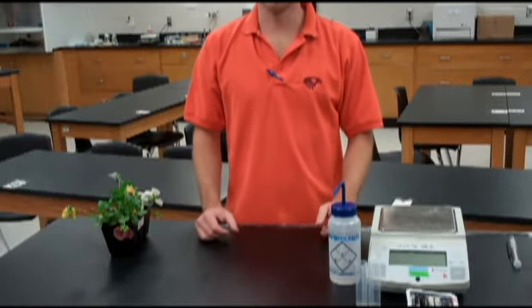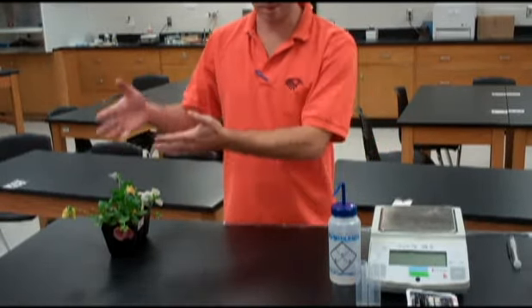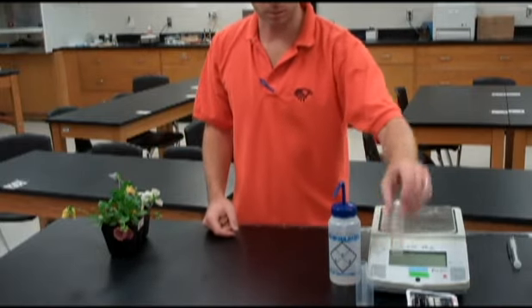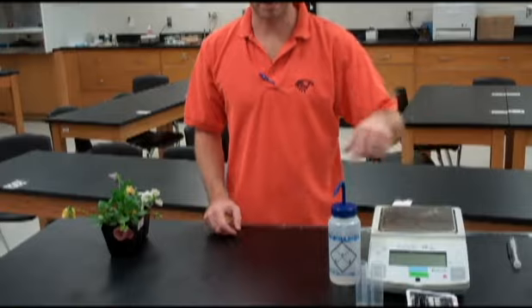Hi, I'm Michael Ralph. Today we're going to be doing the plant water management lab. You need everything you see right here, including some plants, some tubes, and of course a balance.